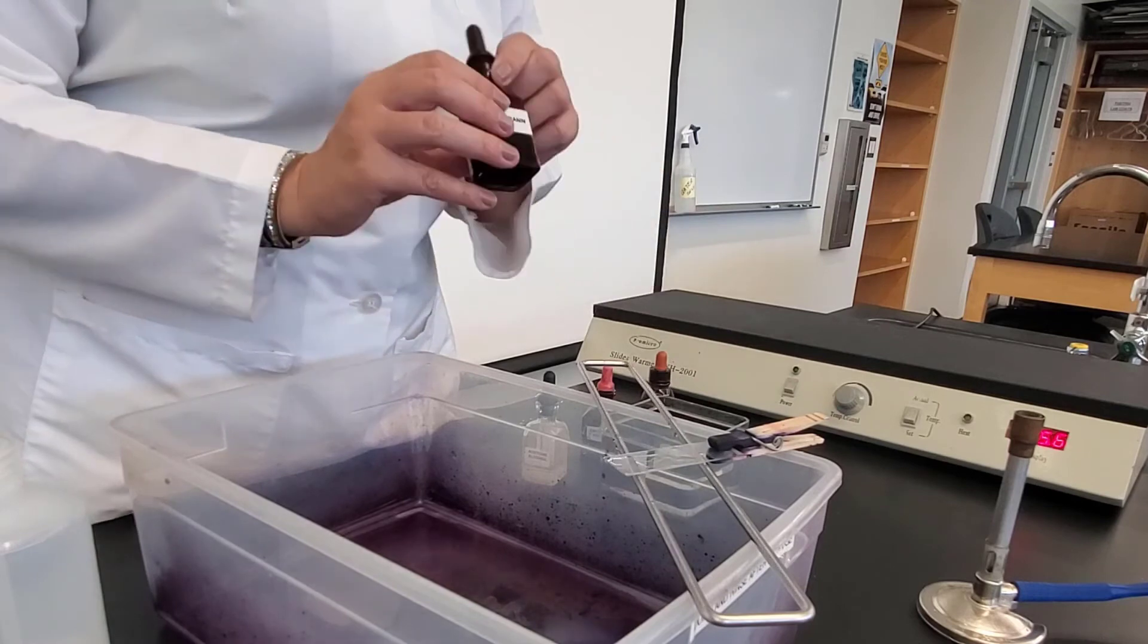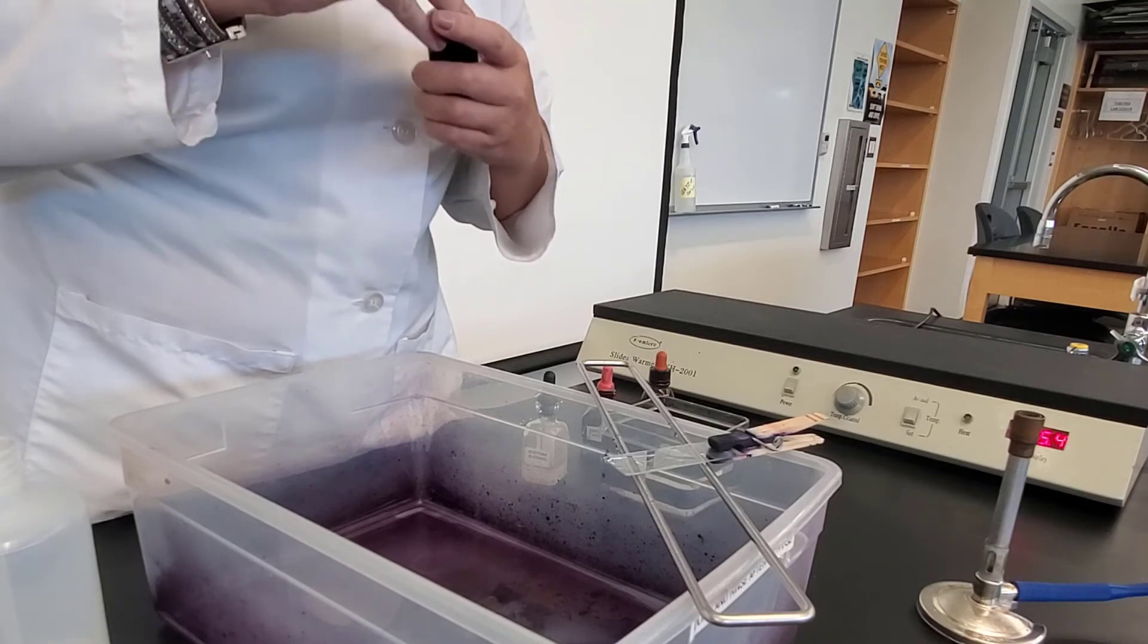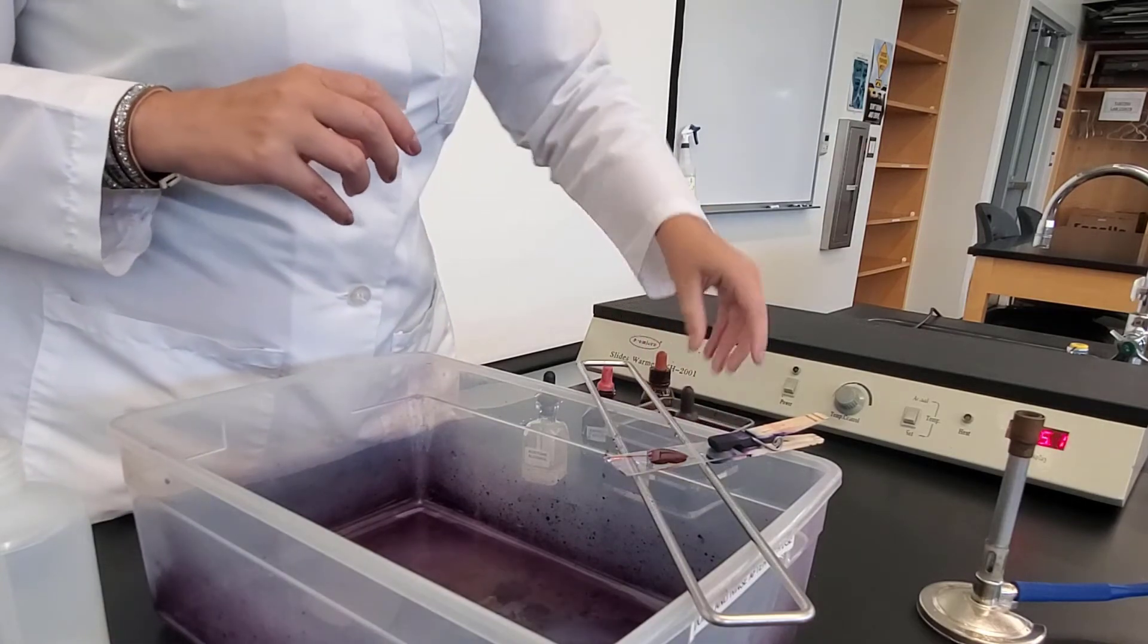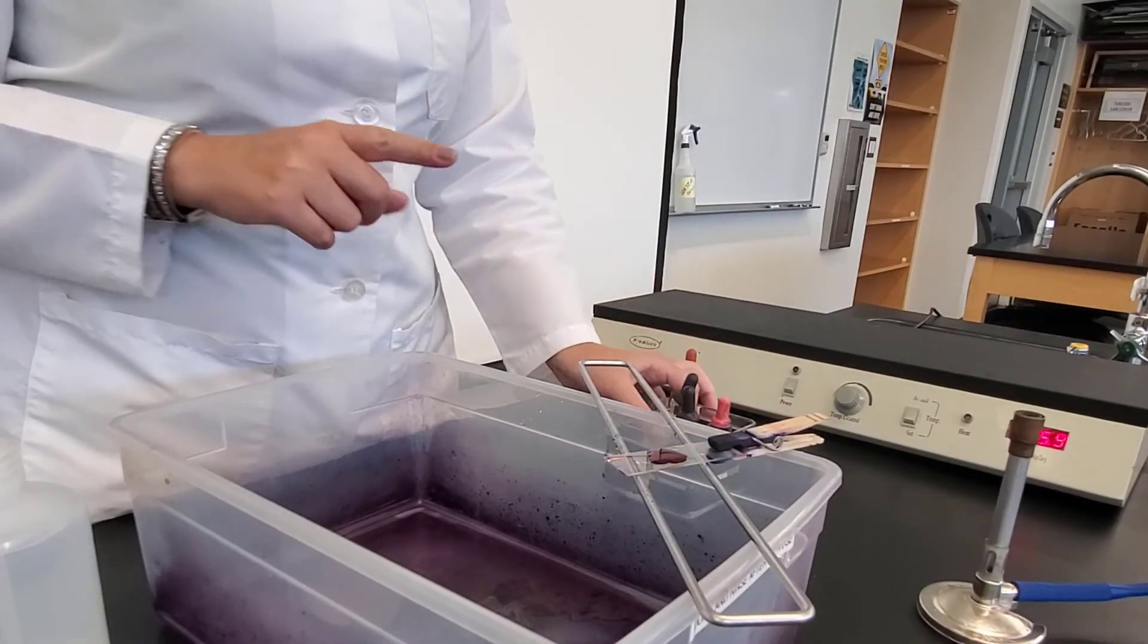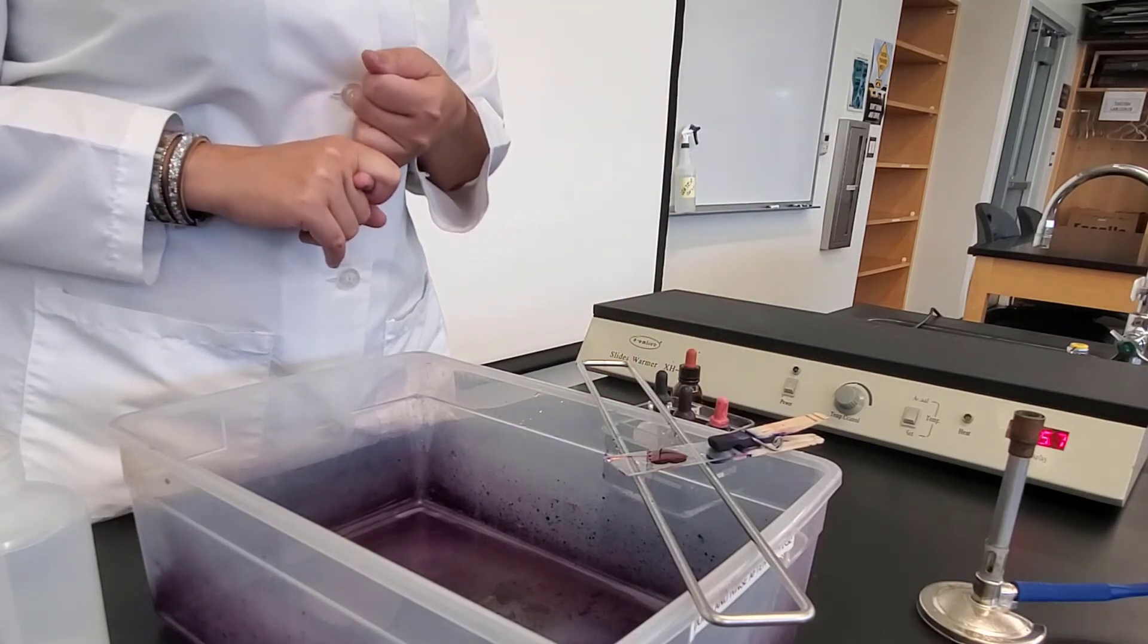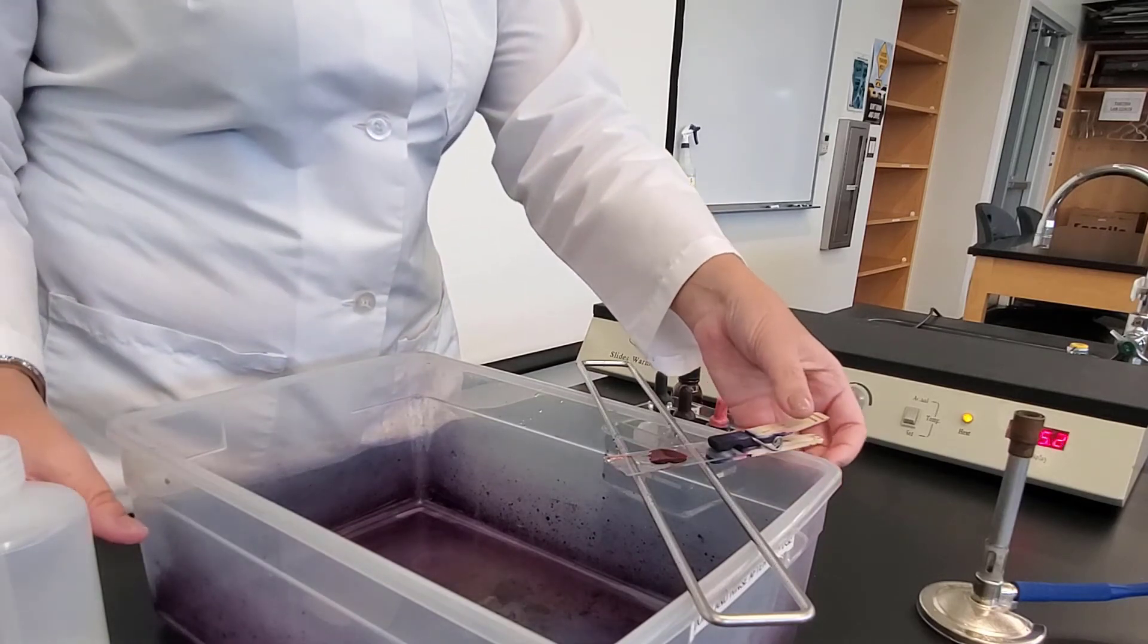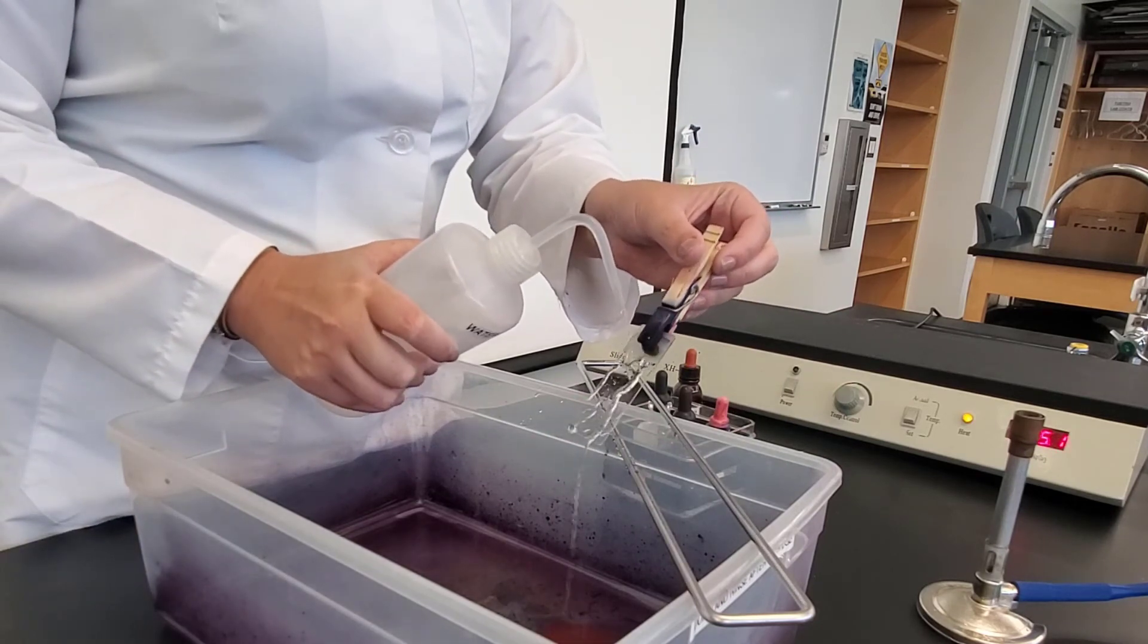And now I'm ready for my last step, which is my safranin, which is my counterstain. And so I'm going to add this to my slide for one minute. So just submerge where the bacteria is and let that sit for one minute. After the one minute, I'm going to take my slide, and I'm going to dump my safranin off. I'm going to again rinse with deionized water, and then I'm going to let my slide air dry, and then put it on the microscope and view under 1,000x magnification. So here we go. My safranin is done. And I rinse.